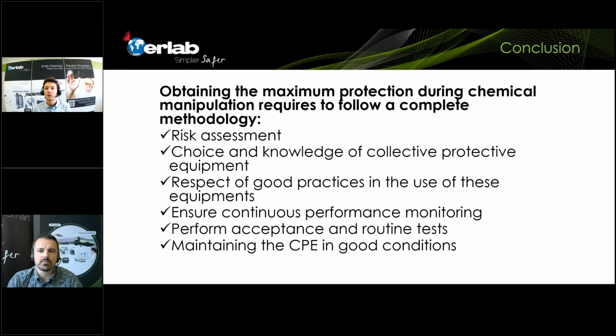A laminar flow cabinet is going to protect the sample inside the cabinet. So if you have a sample that needs to be in a clean air enclosure, the airflow will be the other way around. So the airflow will not go away from you. No, the airflow will go towards the user. So if it goes towards the user, of course you will never use chemicals inside the enclosure. So a laminar flow cabinet is used to protect the samples, and a ductless fume hood or a ducted fume hood is used to protect the user from chemicals. So I hope that is an answer to your question.